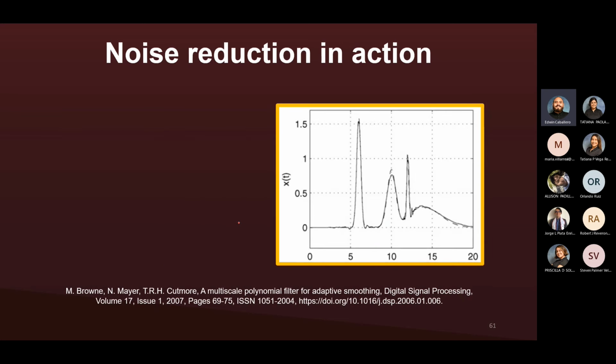What you can actually do is take multiple spectra, and then you simply average them. Since the noise has a fairly random pattern, right? It has a pattern, but it's fairly random. When you sum all of the spectra, you will have ones that are negatives, ones that are positives, and they will cancel each other out. So I recommend you take a lot of measurements and then average them.